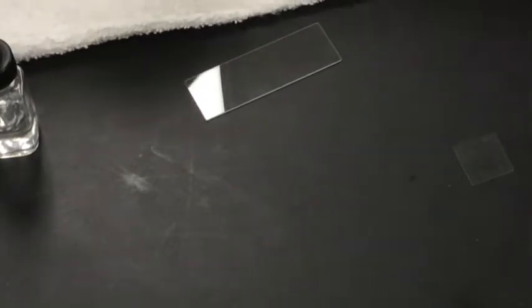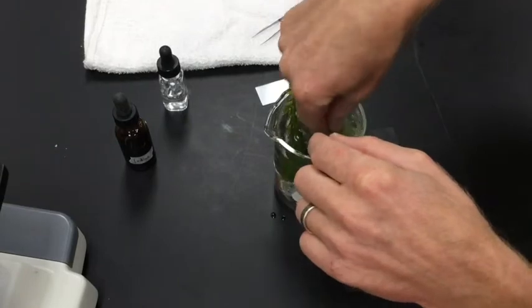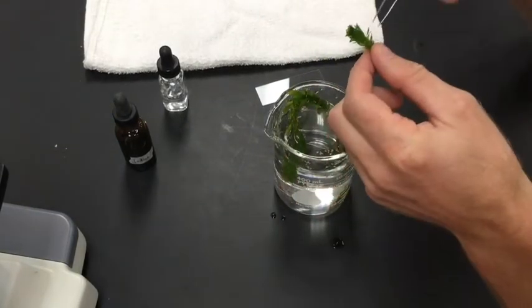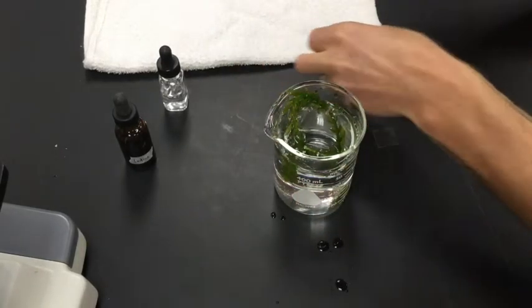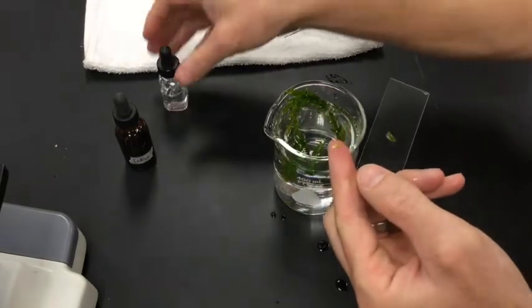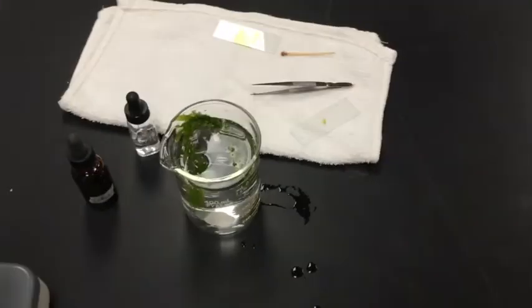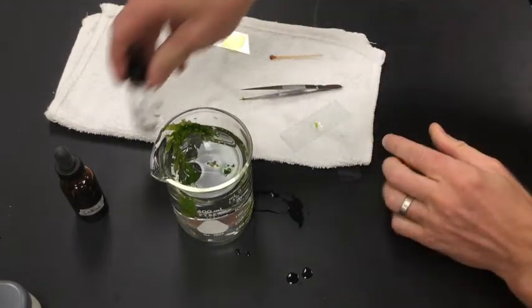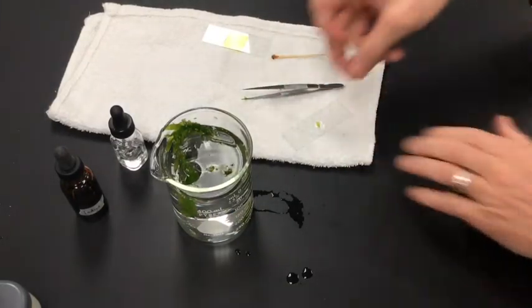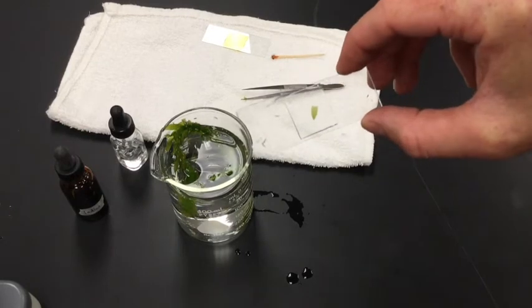For the plant cells you're going to take the Elodea and I would recommend taking out one small leaf at the tip of the plant. Find one leaf and remove it. Place it on a slide, add a drop of water, and take your other cover slip and cover that up. That is the slide for the plant cell — your Elodea, or aquatic plant leaf.